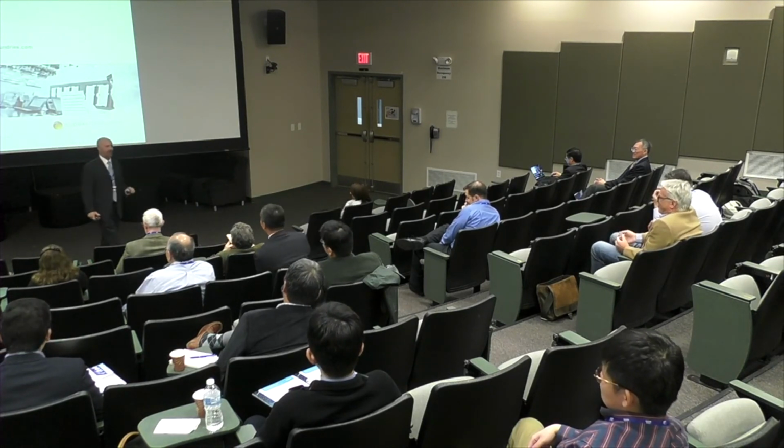Actually, that's a great question. We're working on sample preparation techniques now, using a combination of FIB and polishing. We're looking into low voltage ion milling, whereby we can use focused ion beam, down to 5 keV, to do a cleanup on the surface, and then go in and do a low voltage ion mill. I've already worked out what the details are, and what the threshold is that we need to be below in order to not have a deep amorphous layer, something that makes our signal go away.